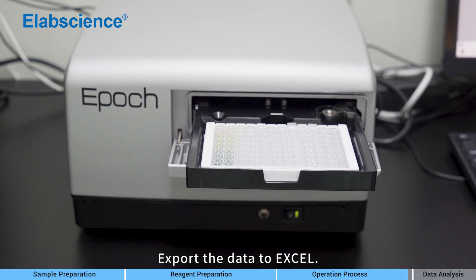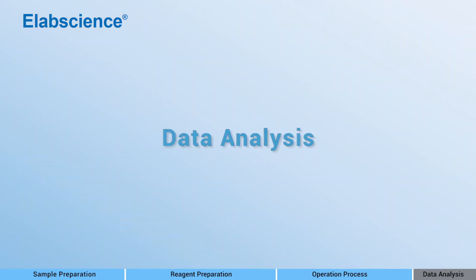Export the data to Excel. Data analysis.